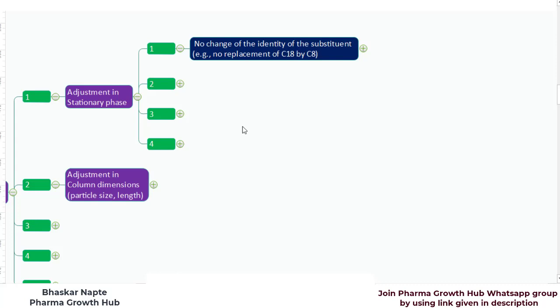According to USP General Chapter 621, no change of the identity of the substituent is allowed. For example, no replacement of C18 by C8. That means if your monograph specifies a C18 column, you cannot replace it with a C8 column for any reason. C18 or C8 is the substituent on the silica surface — those substituents, also called the stationary phase, cannot be changed according to USP 621.